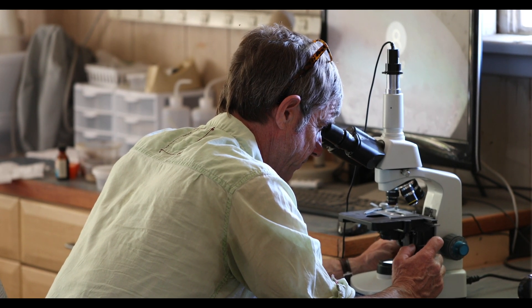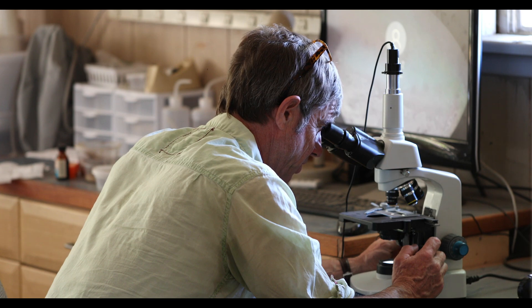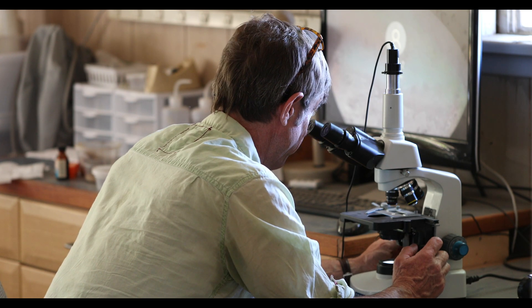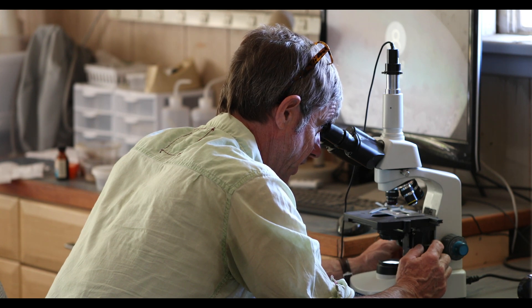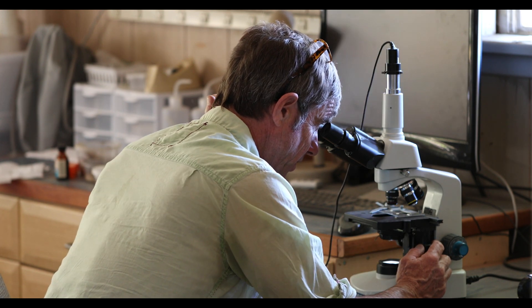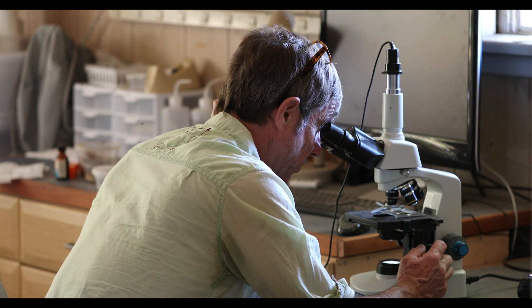We're looking at low power — I'm particularly looking for nematodes or microarthropods at this level. Hopefully we'll get it up on the screen soon. I'm looking at 40x — 40 times magnification — and I'm not seeing any nematodes. I'm not seeing any microarthropods yet.